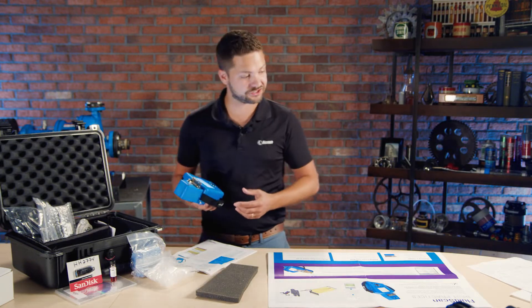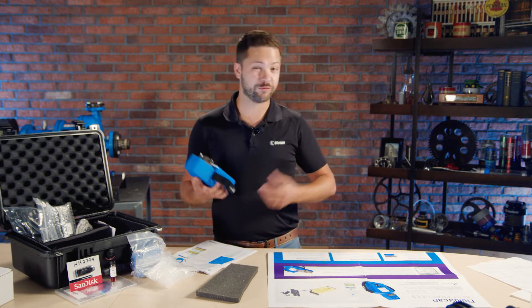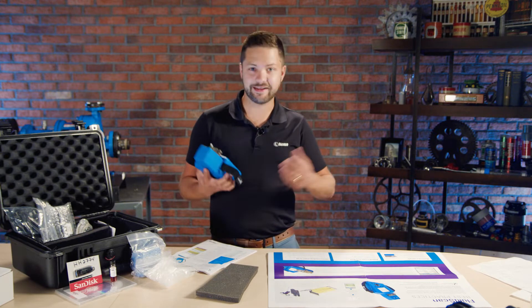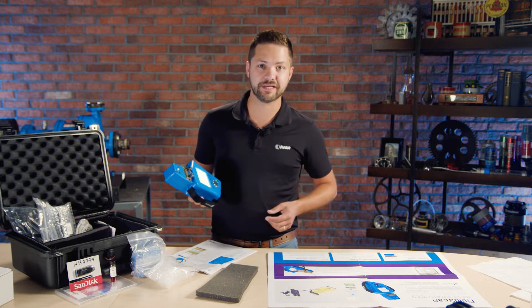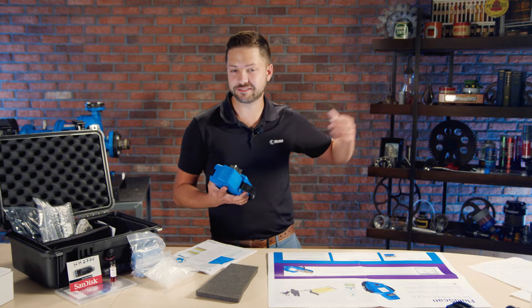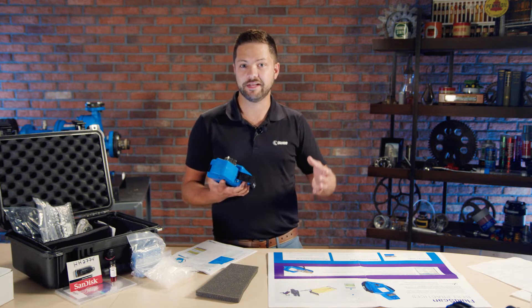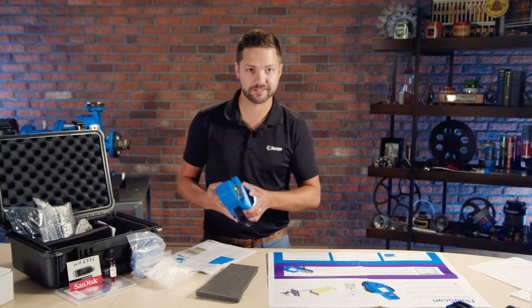I'm anxious to go get a hydraulic fluid or gear oil to test. Really, you can test most any kind of mineral oils, synthetic oil, any kind of application. Most will have the ability to be tested by this and let you see whether or not the machine that oil came from needs to have the oil changed right now — whether it needs to be serviced. That's the benefit right there: being able to know whether or not that machine needs service simply from a quick test like this.